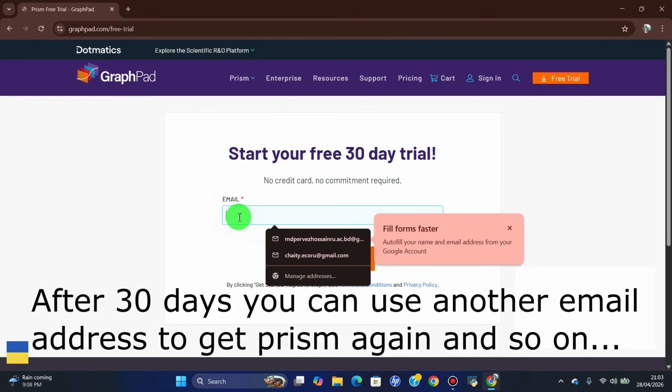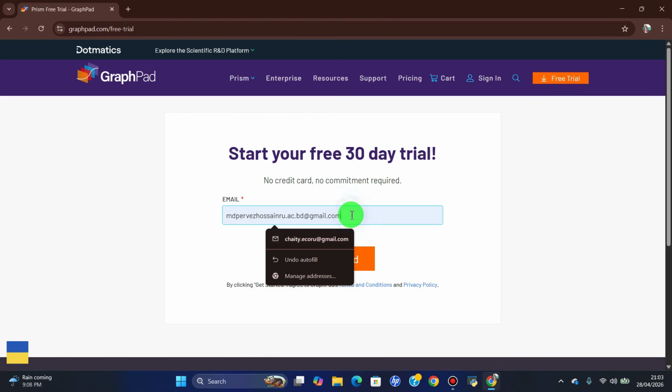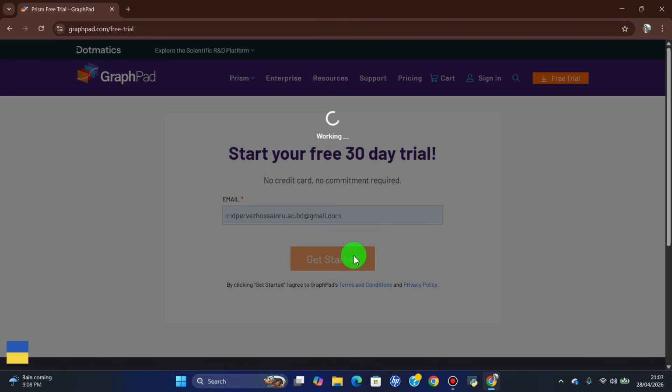And here we will type our email address. I will be using this email address. Please make sure you have entered the right email address and there is no spelling error. Otherwise, you will not be able to install Prism successfully. And once it is inputted, we will click get started.